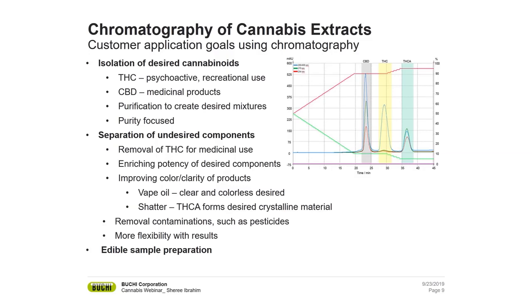Third application is for edible sample preparation. Before we do analytical testing for edible samples, we can use flash chromatography to prepare the sample and remove fat and waxes which may affect the final testing result.